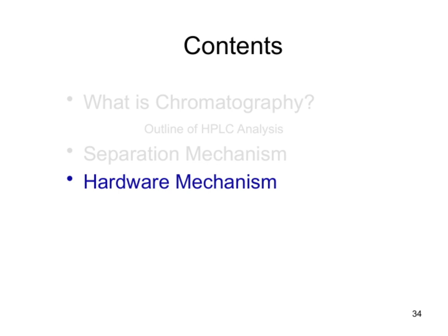It involves how different components in a mixture are separated based on their interactions with the stationary and mobile phases. Essentially, each compound moves at a different rate because of its unique affinity for these phases. Next, we look at the hardware mechanism, which refers to the equipment used in HPLC.